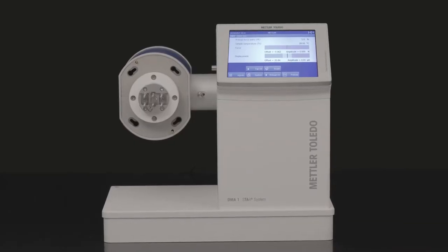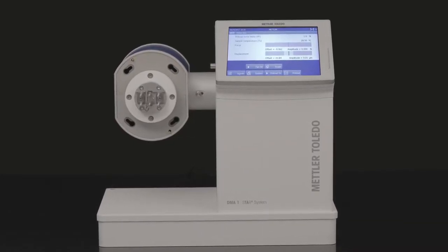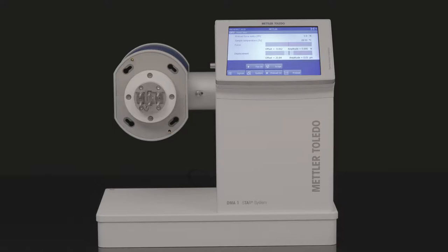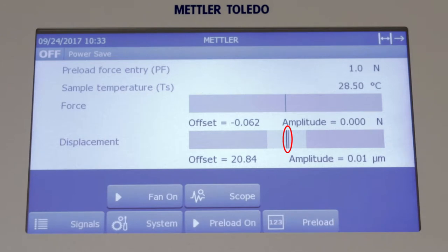The instrument zero position is indicated by the vertical black line in the displacement bar graph in the preparation dialog on the touch screen. When no sample is loaded, the static displacement indicator should coincide with the instrument zero position.